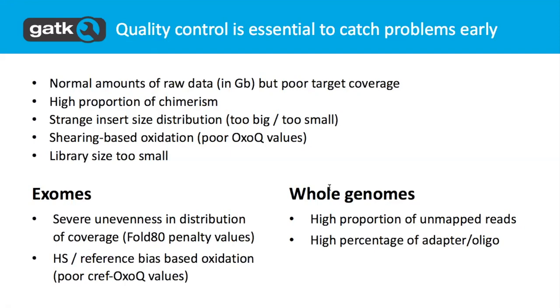We need to collect metrics that help us quantify the oxidation issue. The last problem is that the library size is too small, meaning we don't have a good representation of our sample. So those are the general DNA sequencing issues, but for different data types we can also have different problems that are specific to those types. For example, in exome sequencing, the coverage can be really uneven.